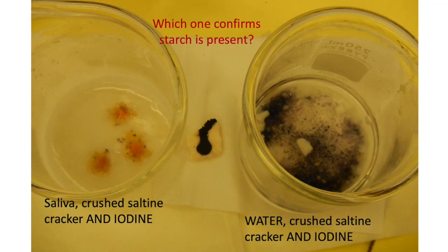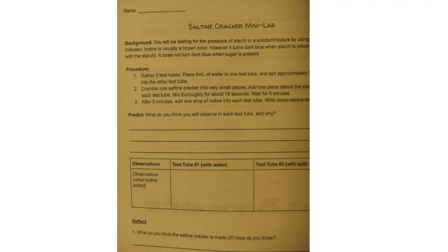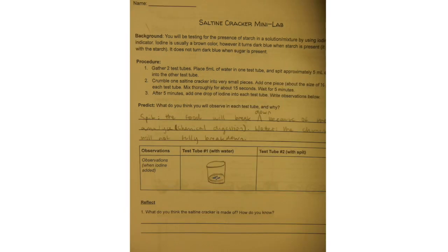And here are the results. Which one confirms that starch is present? Blue-black colour. And any blue-black colour in the left one, the fragment of saltine may have been a little bit large. Then pause as you go through these if you want to with the Cracker Lab and see some of the student additions here.